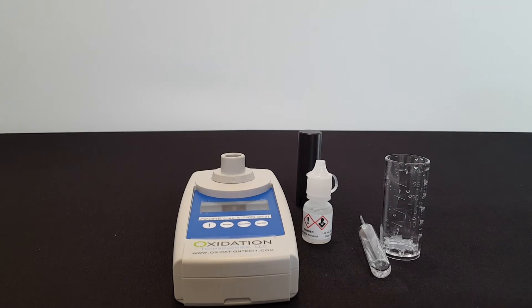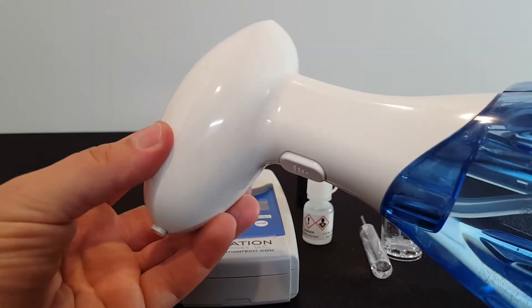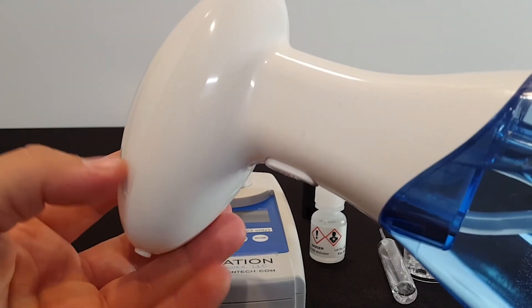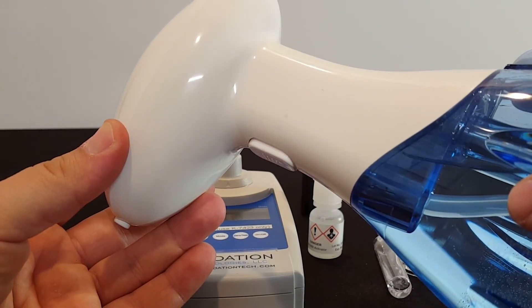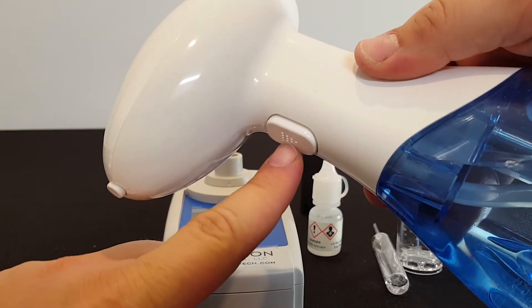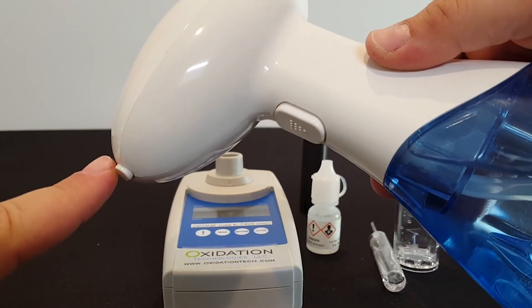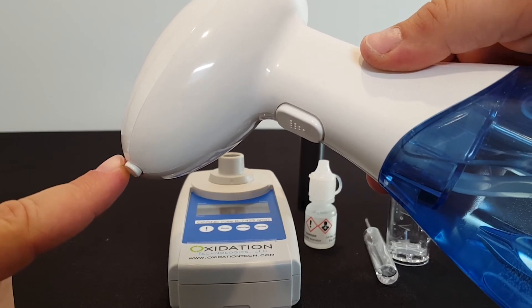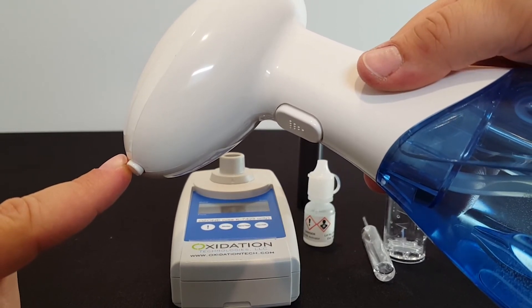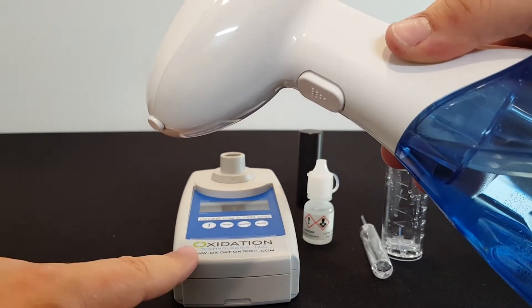I want to briefly explain also how I'm getting my dissolved ozone sample. This is a bottle that we carry that has dissolved ozone in its chamber, and then when this button is pressed, it produces dissolved ozone which comes out this nozzle. So this is what I'll be spraying into the test cup with the activator solution and using for the sample that will then measure with the meter.